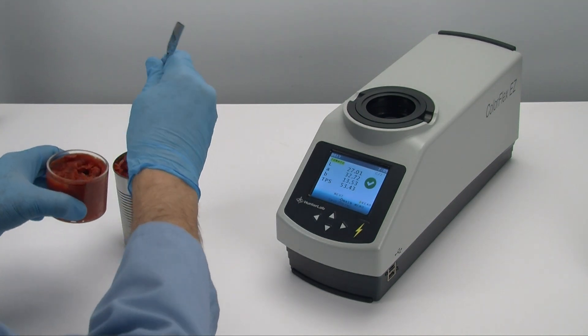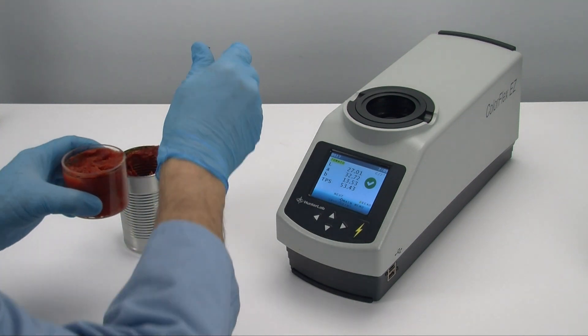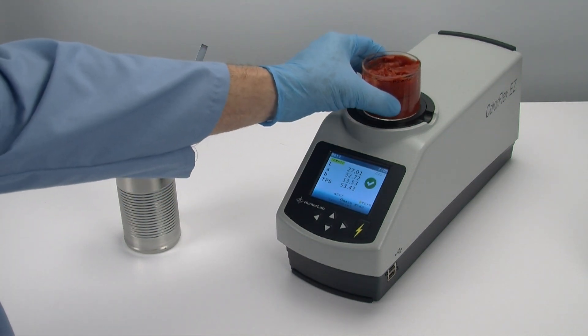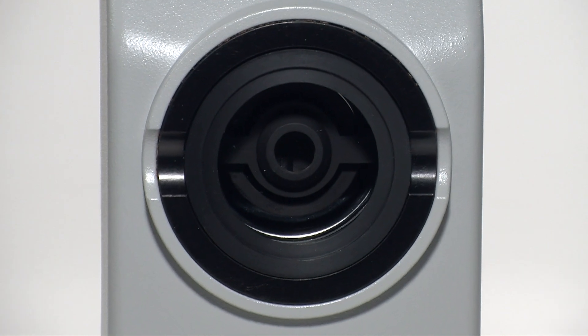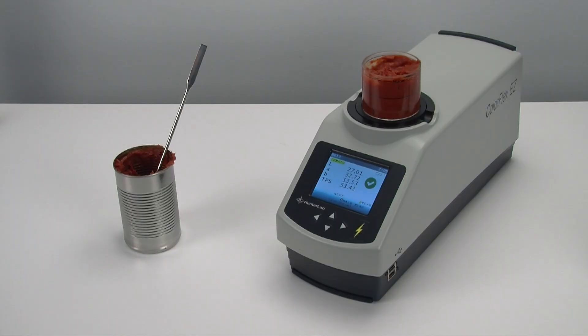This generally is a three-step process using the Hunter Lab tomato product setup. First, put your sample into the sample cup. Place your sample cup onto the open sensor port where it clicks into place for stability. Notice this port is open with no visual obstruction to the full measurement area of the sample cup — only your sample is measured.